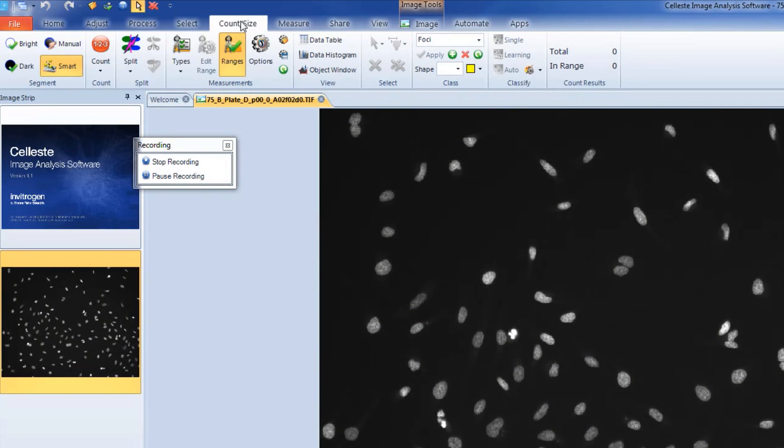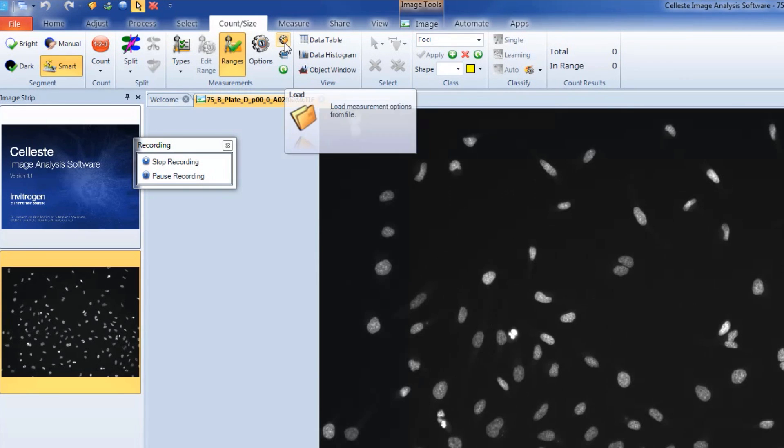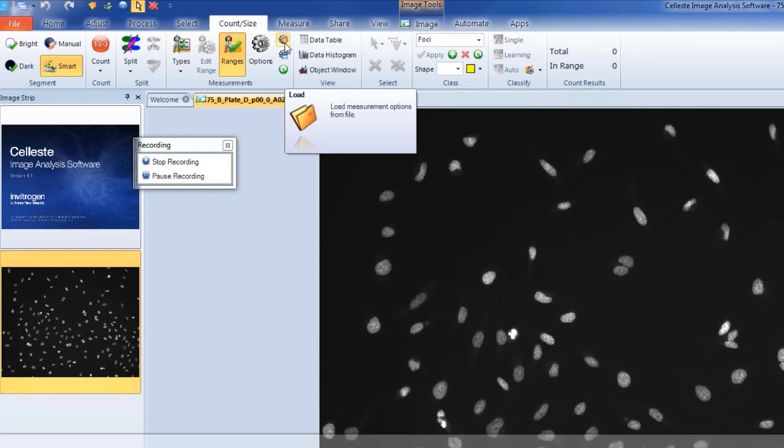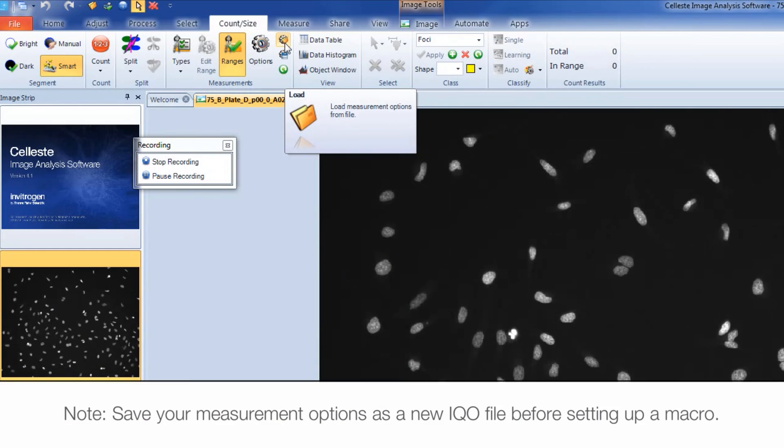From the Measurement Options group, you can load your desired IQO file. This will load previously saved settings into Celeste software. It's recommended that you set up your measurement options and save them as a new IQO file before setting up your macro.